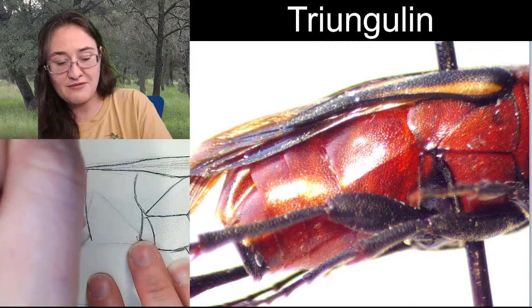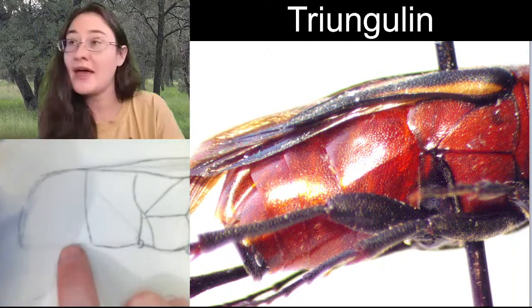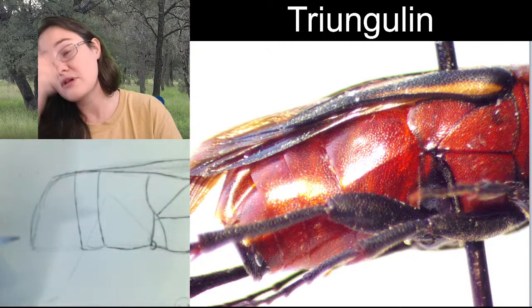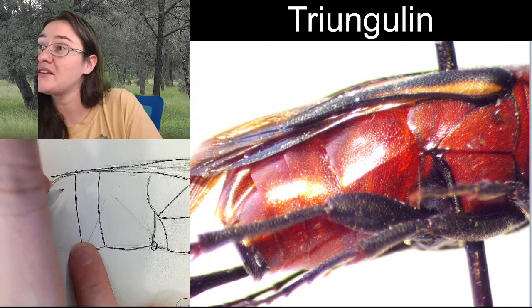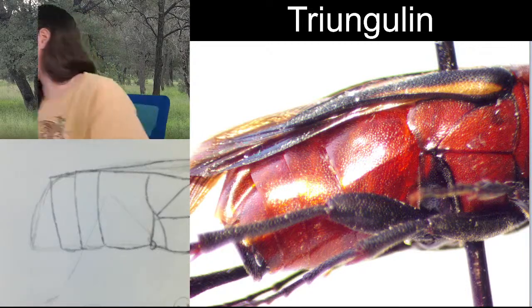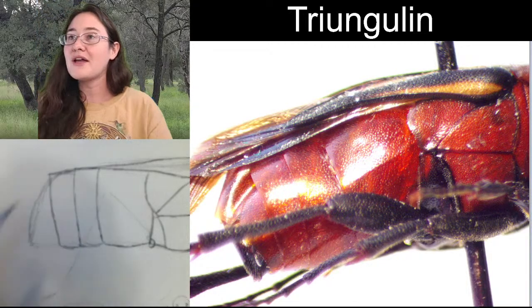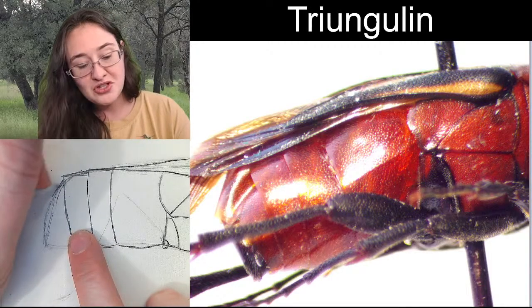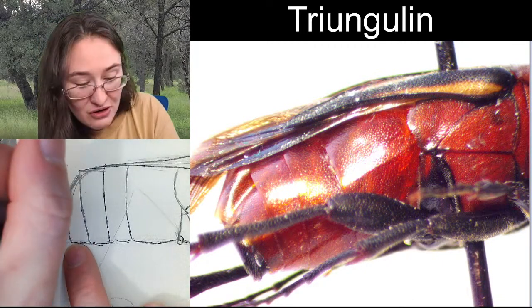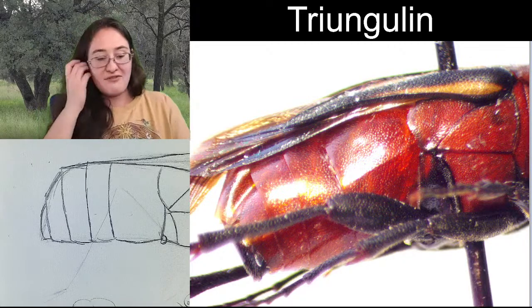All right, the first segment of the abdomen is pretty wide. And then the second segment is probably about half that. And the third segment is about the same as the second. And then that last one almost looks like it's caved in just a little bit. Oh, it's not even the last one. So this next one almost looks like it's caved in a little bit, but it is the one that kind of starts the abdomen getting shorter. And then there is one final little itty bitty segment here at the end. So it looks like we have 1, 2, 3, 4, 5 abdominal segments.